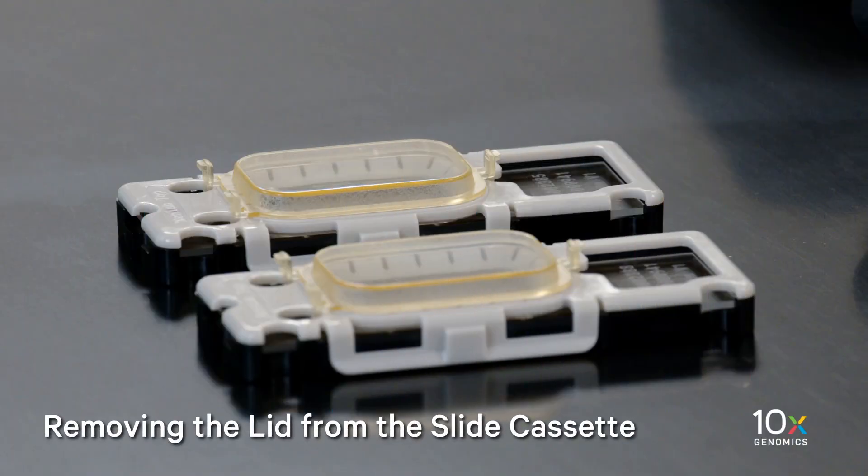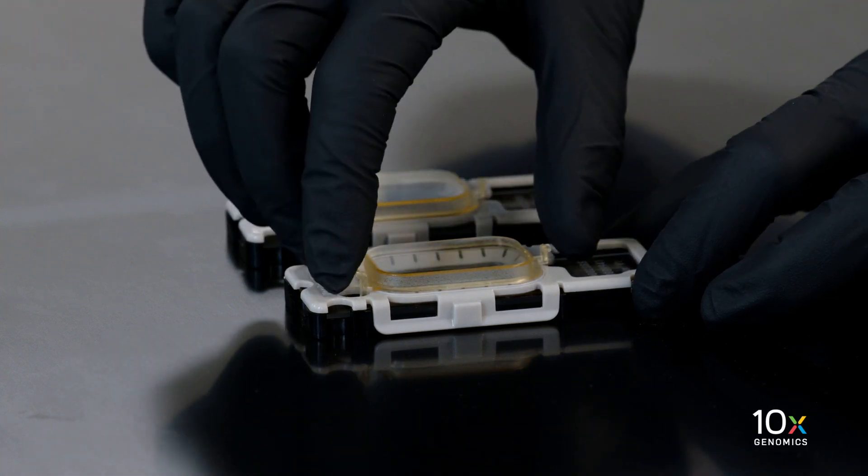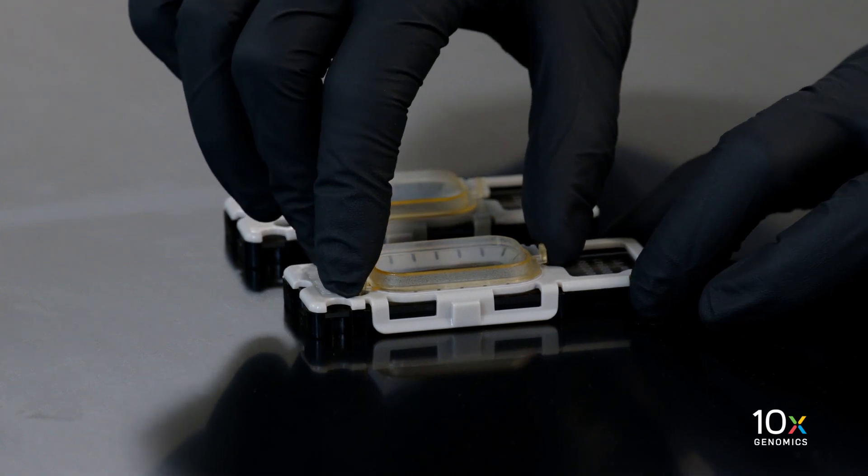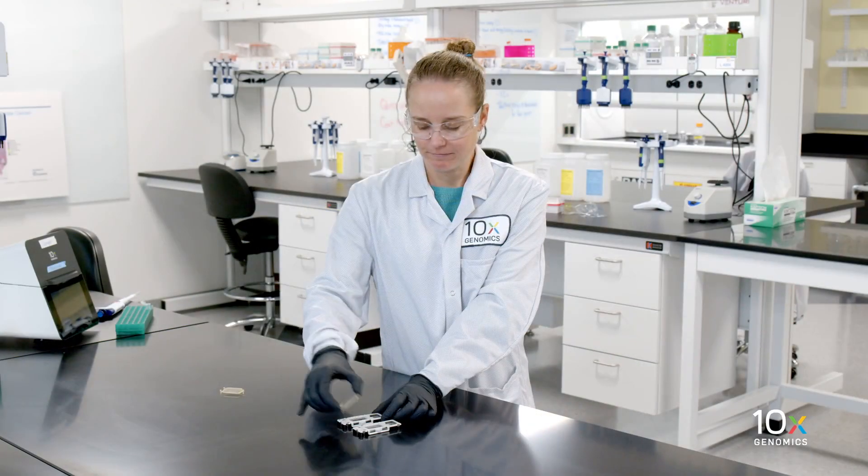After incubation on the thermal cycler, we will remove the slide lid. Securely hold the cassette on a flat surface. With the other hand, push on the top of the two upper tabs with index and middle fingers. Use your thumb to push in on the lower clip. While maintaining inward pressure, pull upward with your thumb until the lower clip disengages. Ensure that no liquid splashes out of the well.